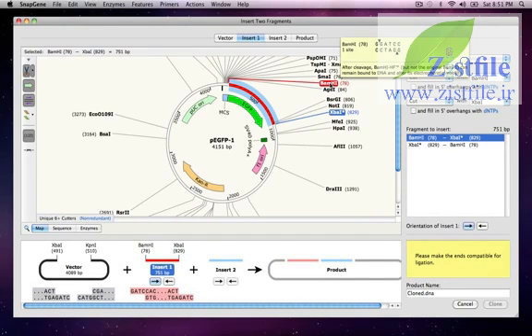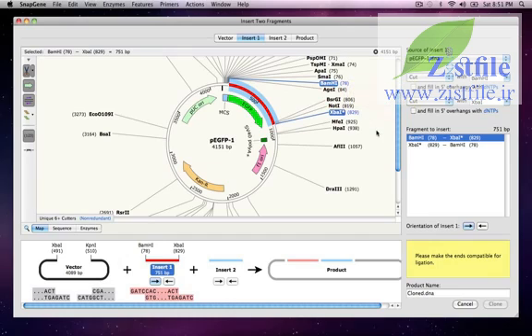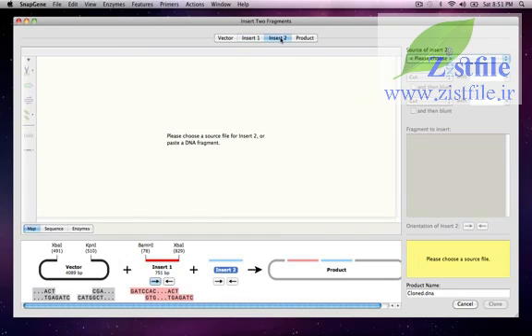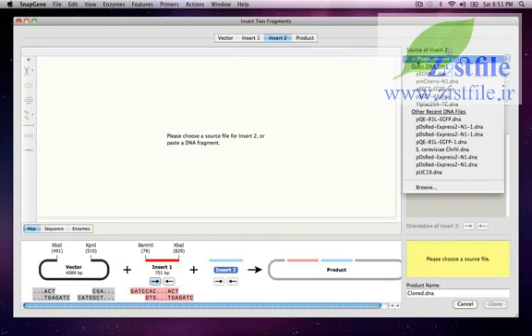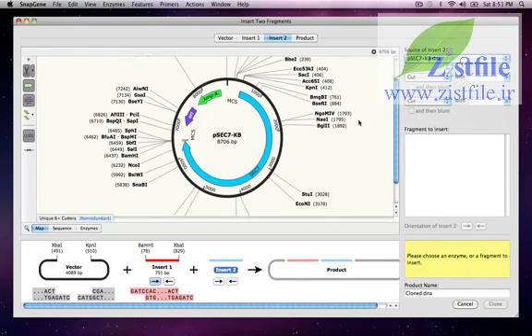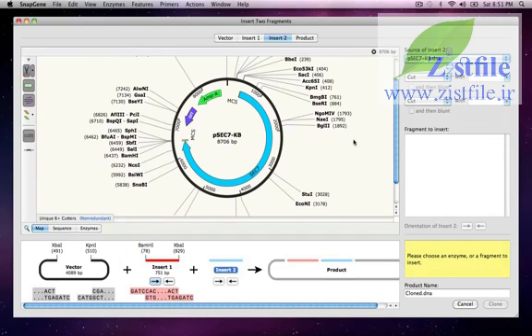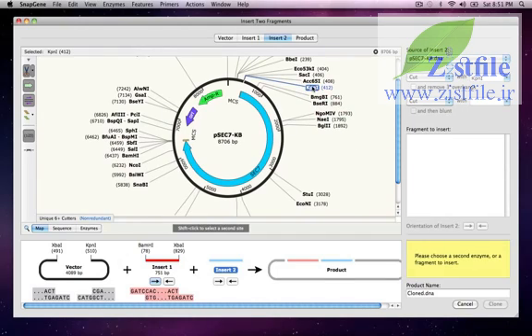Now I'll click on the Insert Two tab and then choose a plasmid called PSEC7KB, which contains the SEC7 gene flanked by KPN1 and BAMH1 sites. I'll click on KPN1, then shift-click on BAMH1 to select the SEC7 gene.